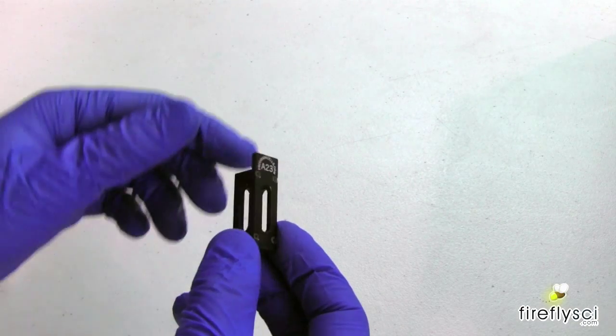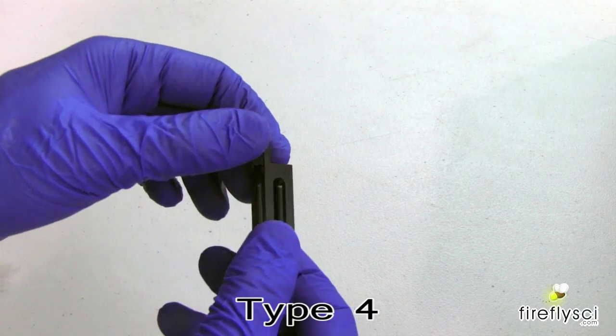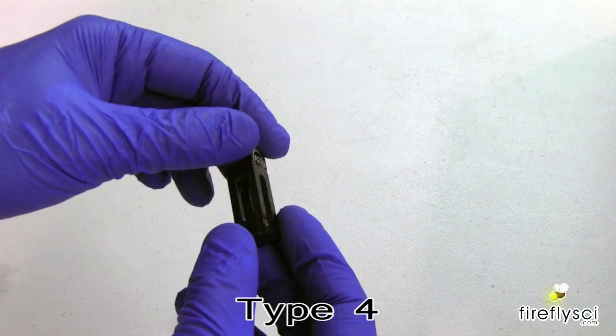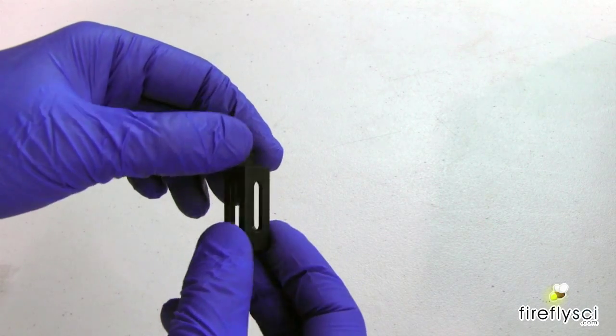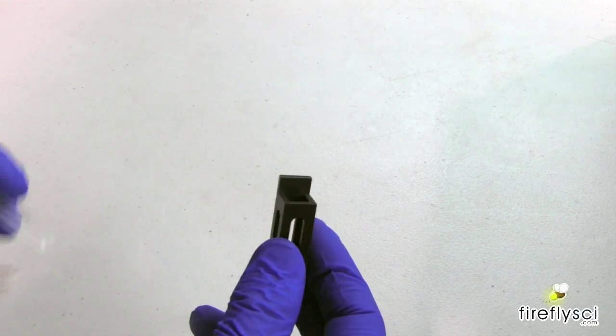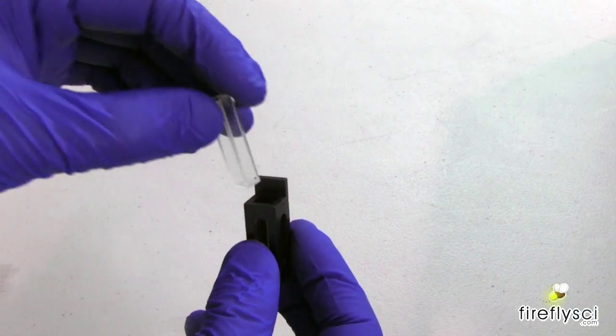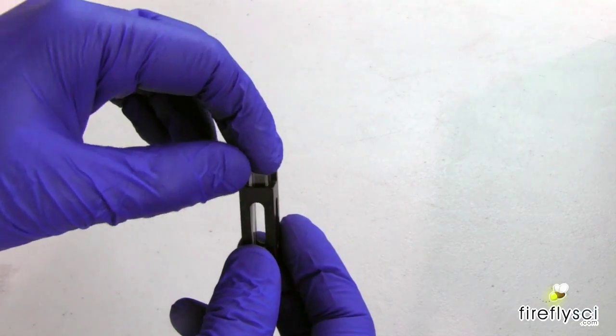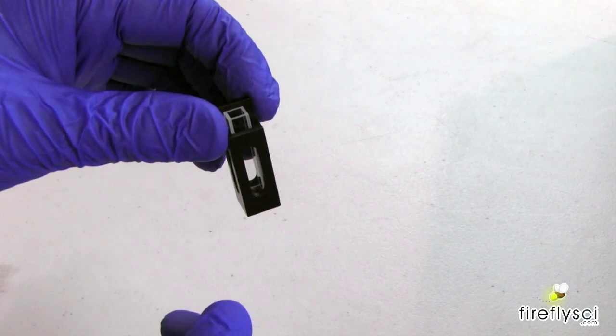So next we have our A23 cell mount. So this is for our Type fluorometer cuvette. And as you can see here, it has all four sides open. And it's very simple to insert the Type 4 and all you have to do is put it right in the top and slide it down in and it is good to go.